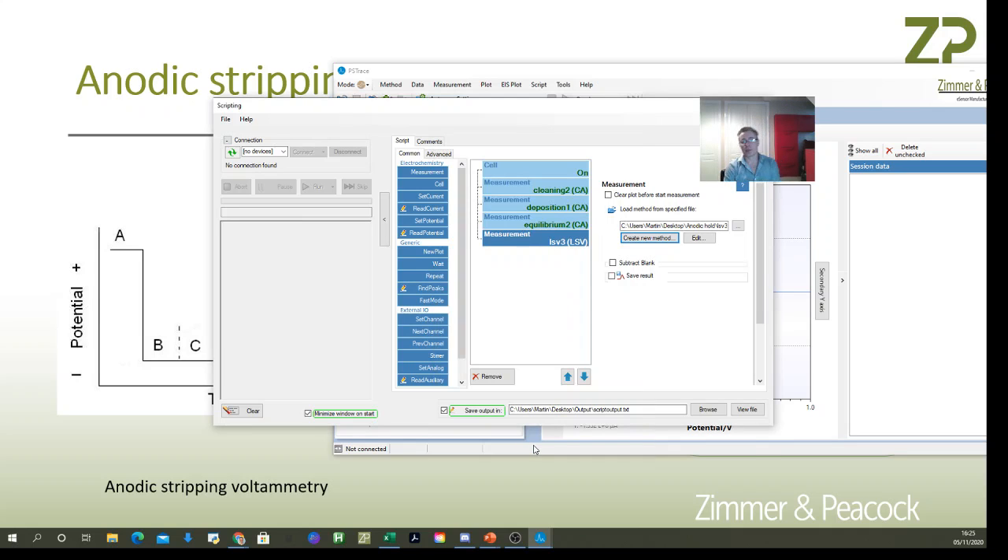So that sequence will turn the electrode on, run a cleaning step, a deposition step, an equilibrium step, and the linear sweep voltammetry. That's how you do anodic stripping voltammetry using a small potentiostat with screen printed electrodes, using the scripting feature to write a nice sequence of experiments. I hope that helps — thank you very much for watching.